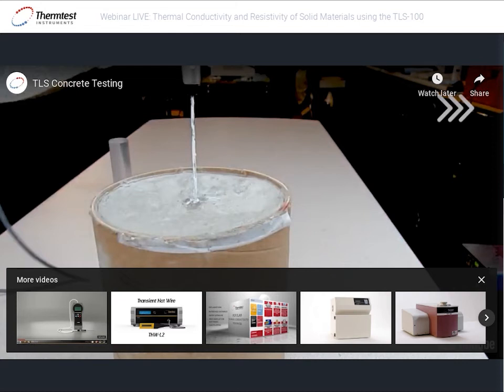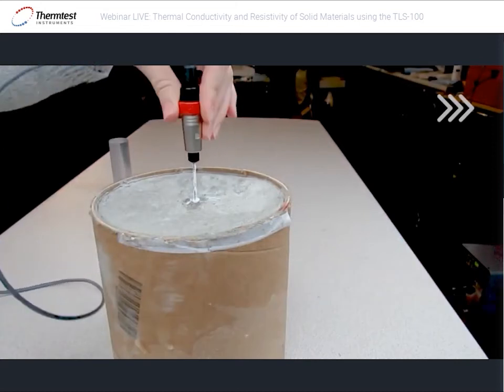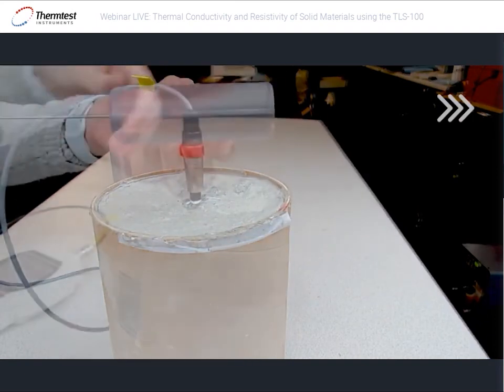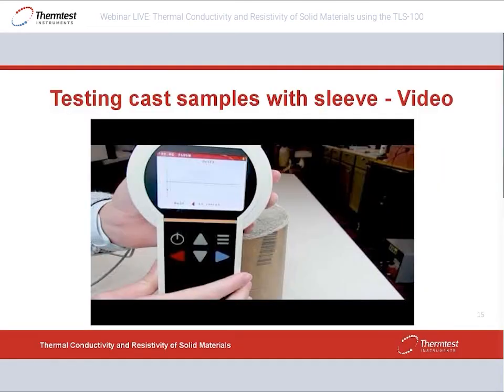It's very similar, of course, as before. You cover the needle, and in this case, it's much longer, and it has to go into this quite small hole, but it needs to go all the way in. Also here, you need to use your contact paste.